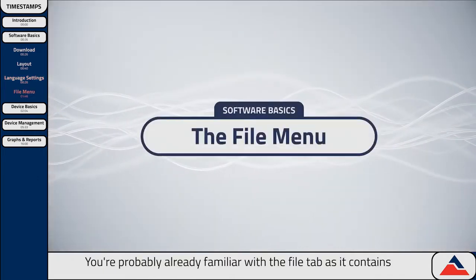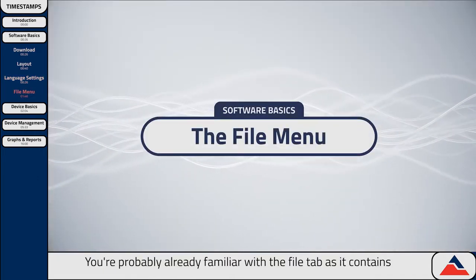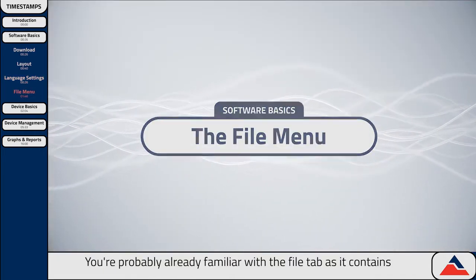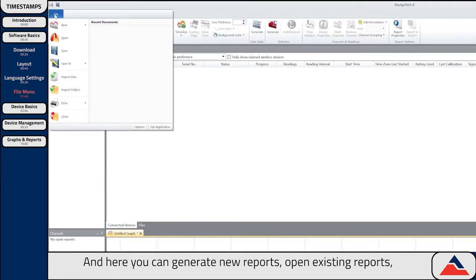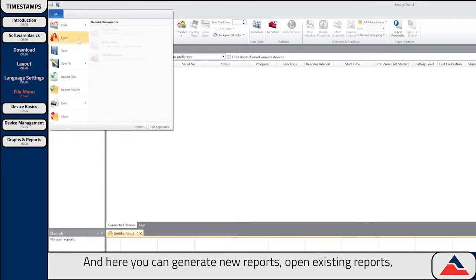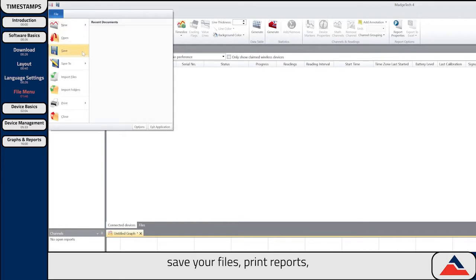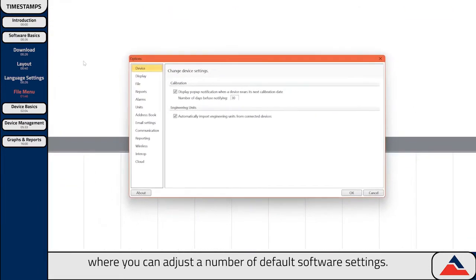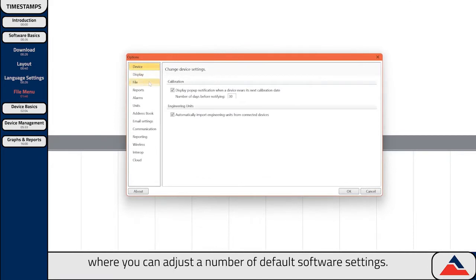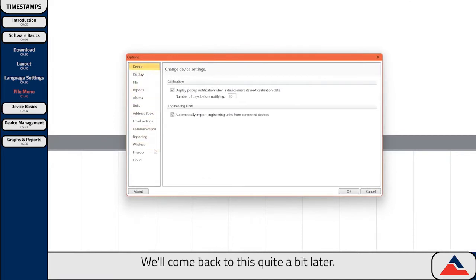You're probably already familiar with the file tab, as it contains all the standard functions you'd expect to find in most other software. In here you can generate new reports, open existing reports, save your files, print reports, and as established, Options, where you can adjust a number of default software settings. We'll come back to this quite a bit later.